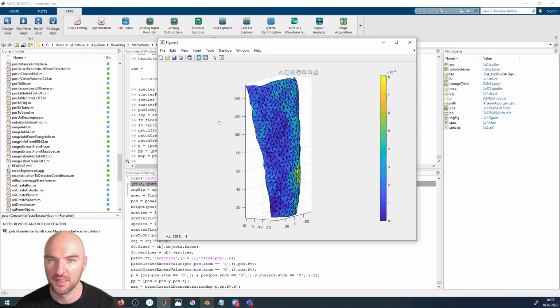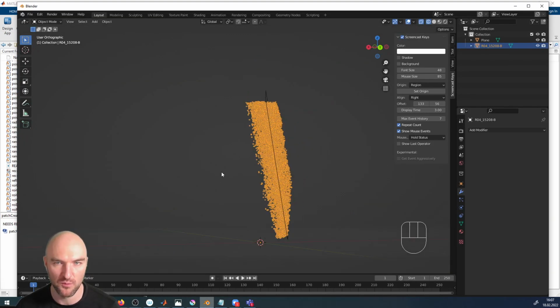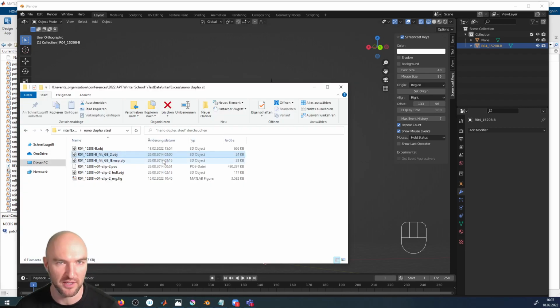Okay. One thing we can do with that is export it. But we were missing one function in the exporter, which is a bit of a shame. But nonetheless, I'm going to show you what I mean by exporting. So if you look into the folder here, you've got something called a PLY.